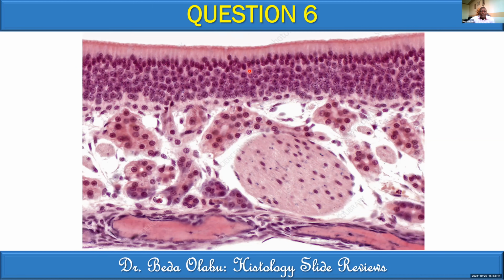Let's try today rather than wait for the exam to try it. Yes, Emmanuel. This is the complex epithelium. Well, this one is not complex, Doc, because we are able to determine the shape of the cells on top. So it's not complex. Somebody else want to try? Yes, Stephen? Just trying. It looks like pseudostratified columnar epithelium without goblet cells. Yes, this is the pseudostratified columnar epithelium without goblet cells.